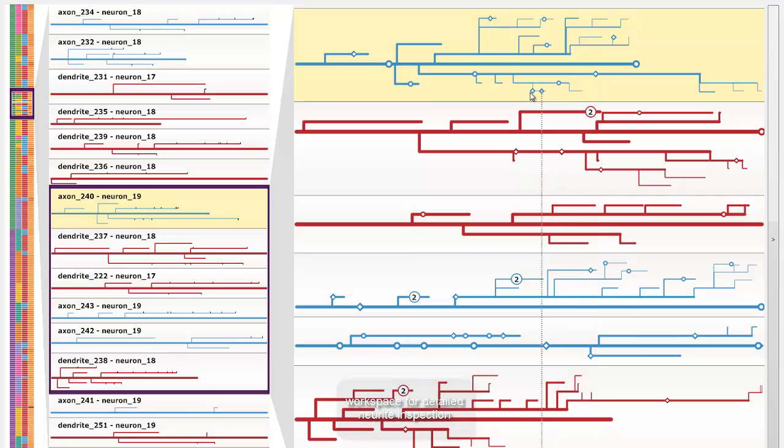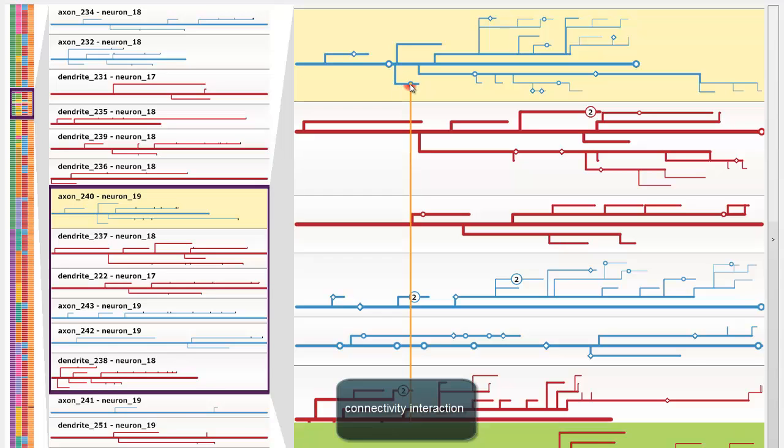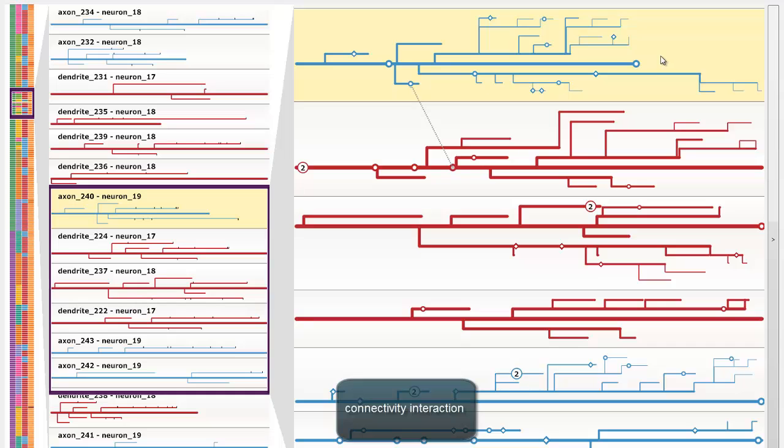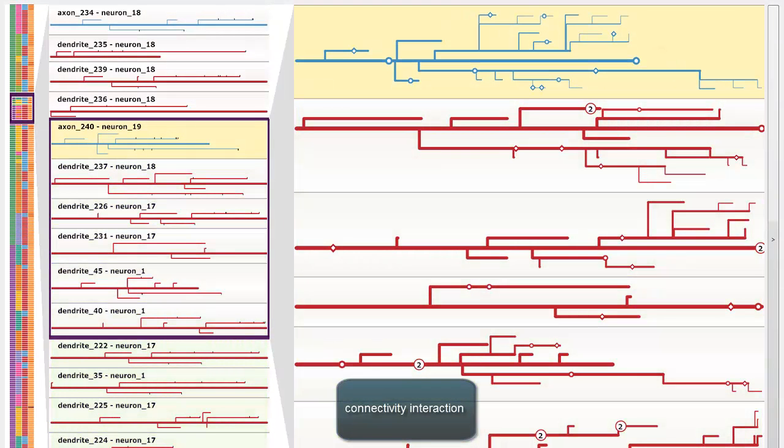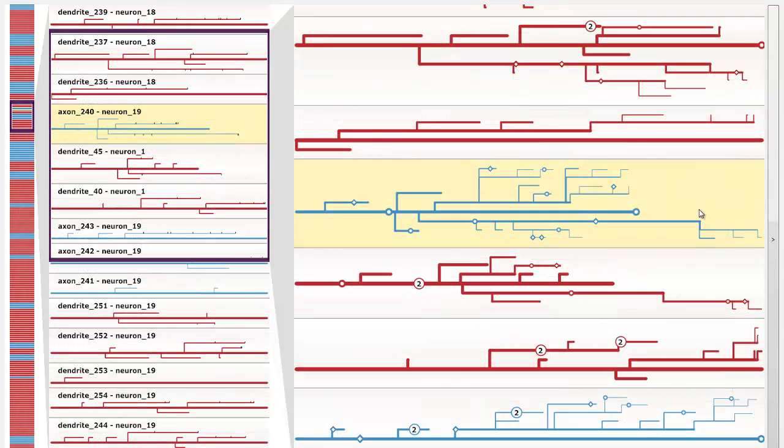Links to off-screen neurites extend to the screen borders. To explore the connectivity between neurites and their synapses, connected off-screen structures can be fetched and placed next to the current neurite. As an alternative, we can fetch all connected structures at once and sort them according to connectivity strength.